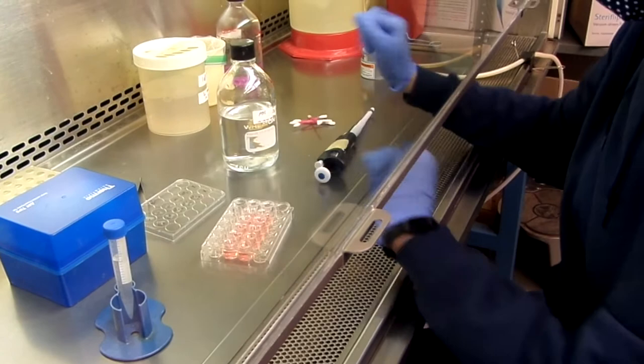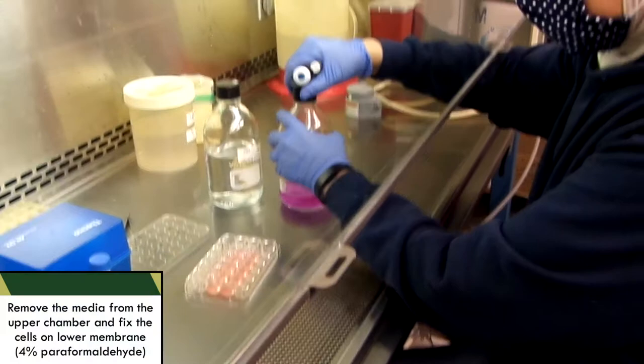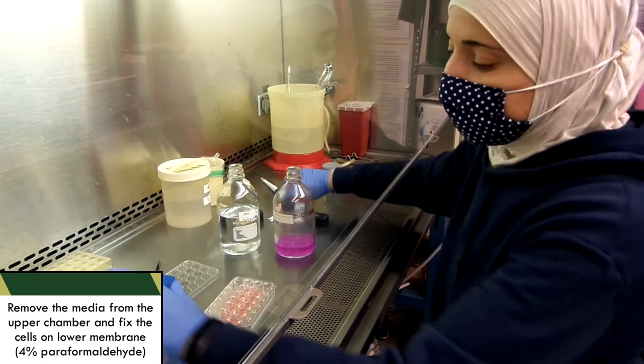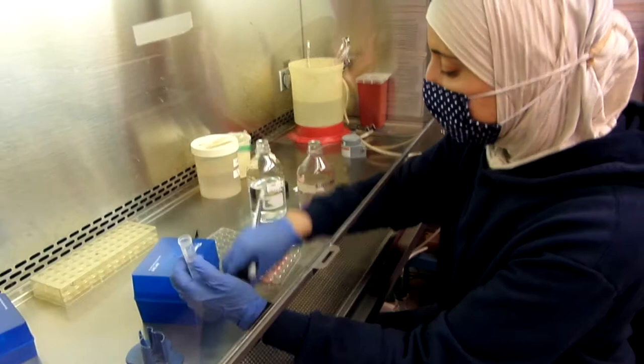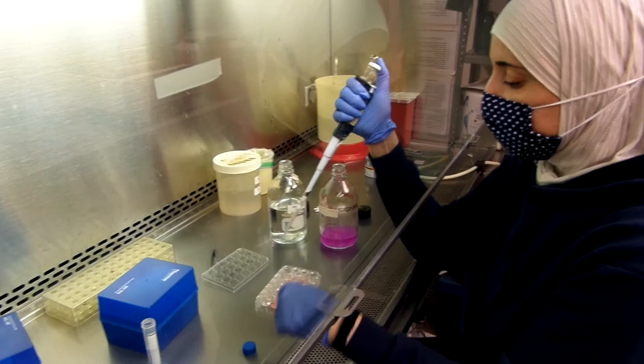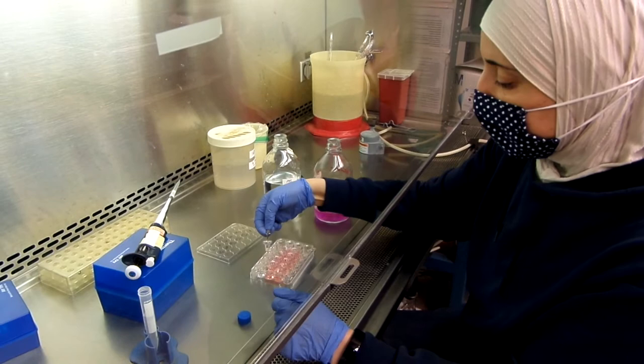Then, what I will do is take out the media in the upper chamber. Then, I'll fix the membrane, the cells on the lower membrane. I have this fixative, which is 4% paraformaldehyde. I will add one ml in these extra wells and move this transwell into the new well that has the fixative. And I'll do this for the remaining transwells.